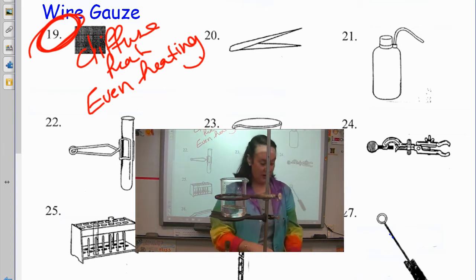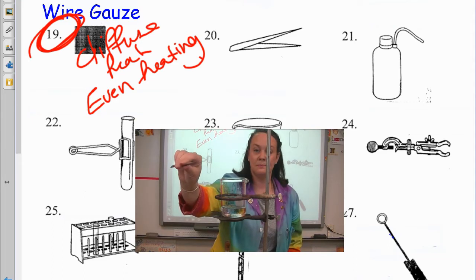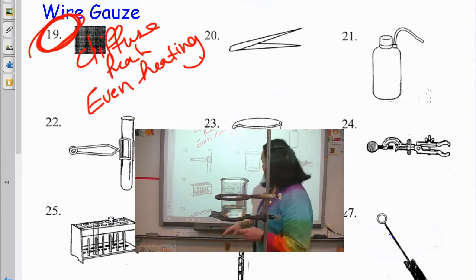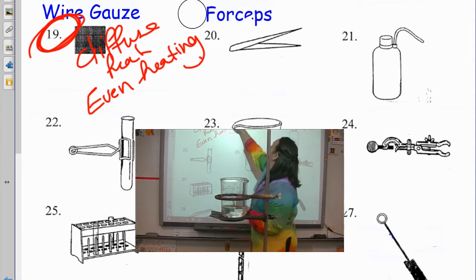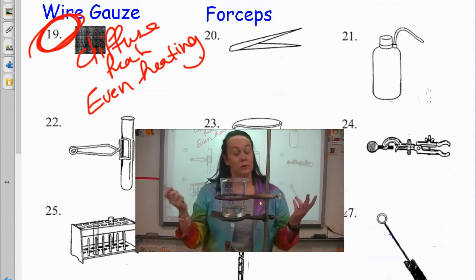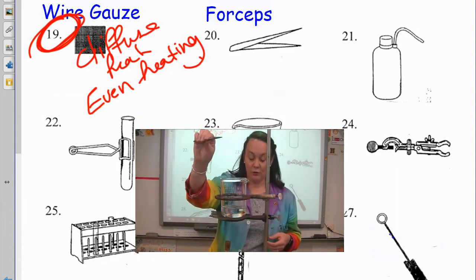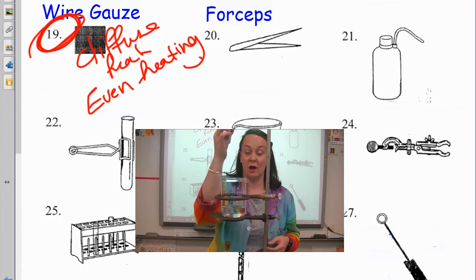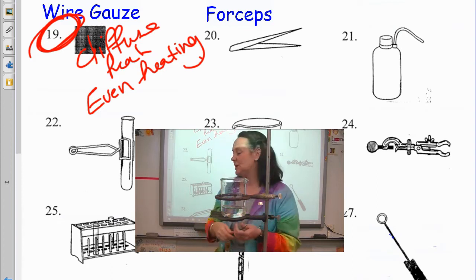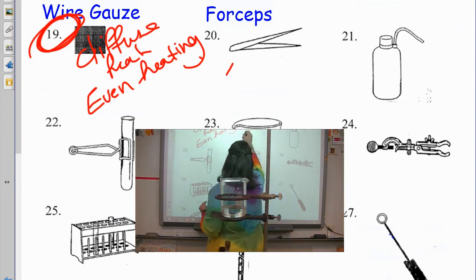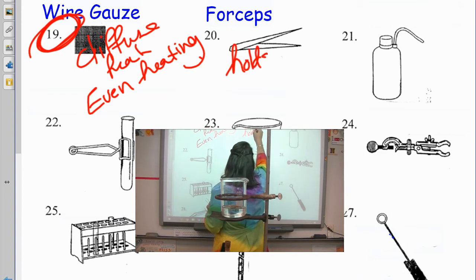Next, we have some forceps. Forceps. Some people call them tweezers. I don't know. My professor in college always called them forceps, so that's kind of what stuck with me. Forceps are just for holding small solids that maybe you shouldn't be touching. So, hold small solids.